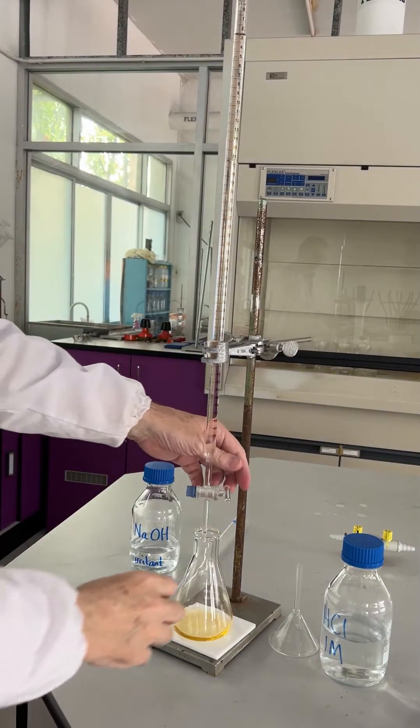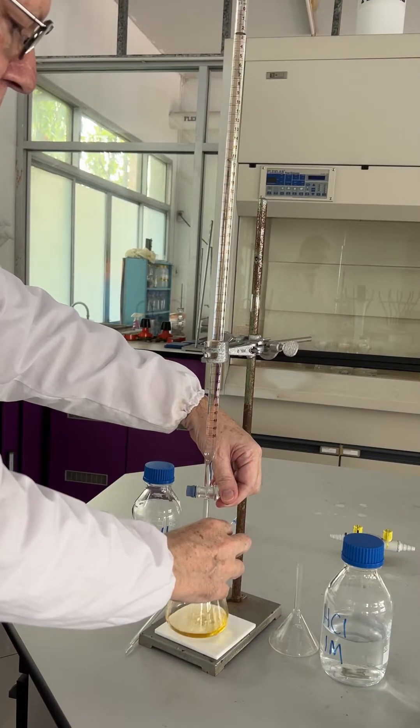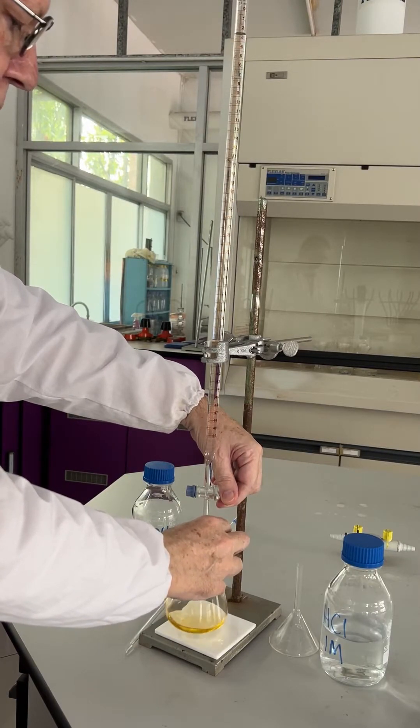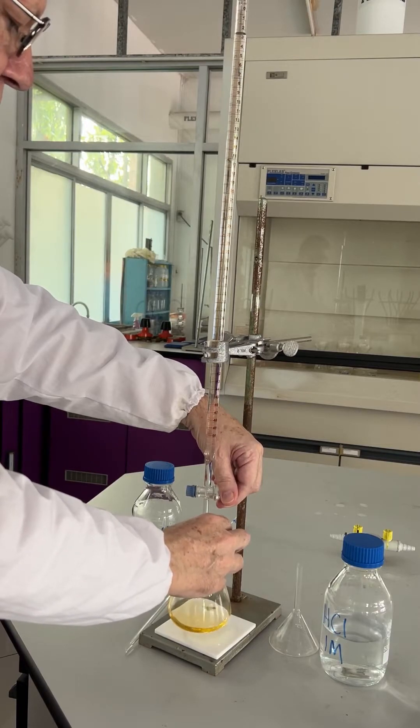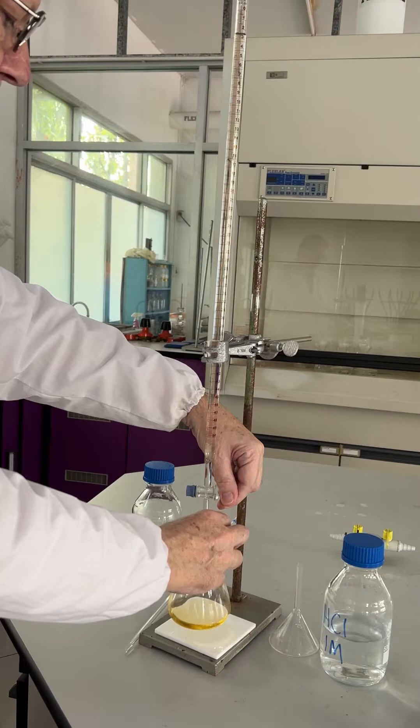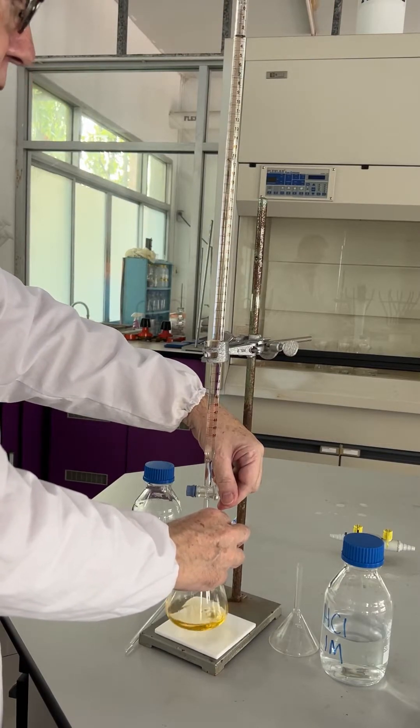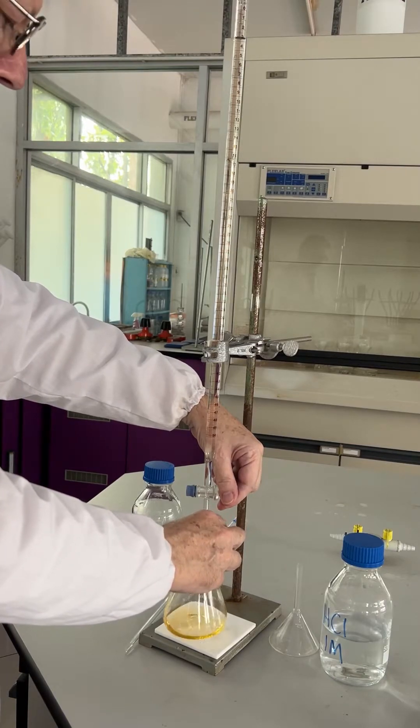We now need to run... sorry, acid into the alkali. And we stop adding when we get a permanent change in color. So we start at 2.4.